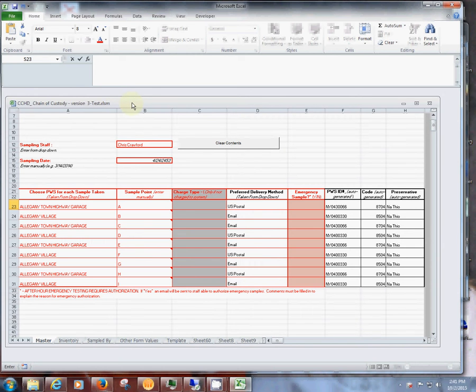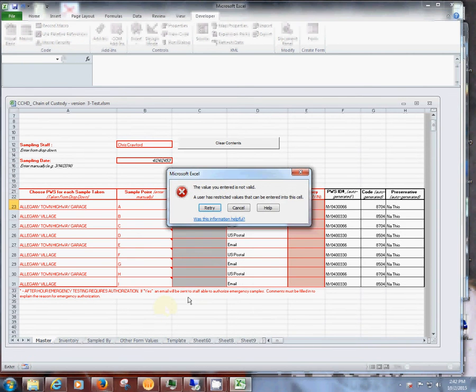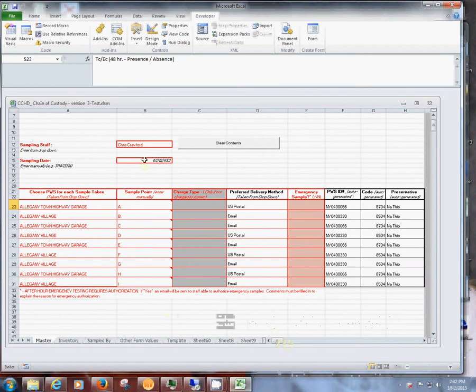As mentioned in the previous videos, this is a Microsoft Office application with the code stored in each individual spreadsheet. I could show it to you here, but I didn't activate all of that. Of course now it's all going to freeze up on me. Oh no! Alright, this should all look familiar to you.